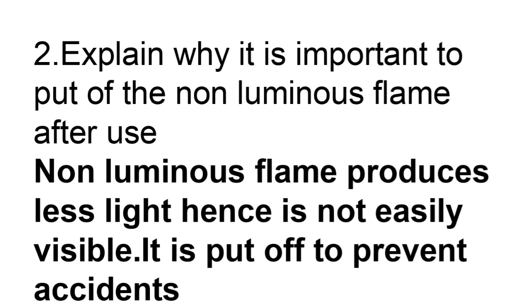So the reason why we put it off after use is to prevent accidents. You need to explain that it produces less light, hence it's not easily visible, and therefore it can cause accidents. When it is not in use, it should be put off to prevent accidents.